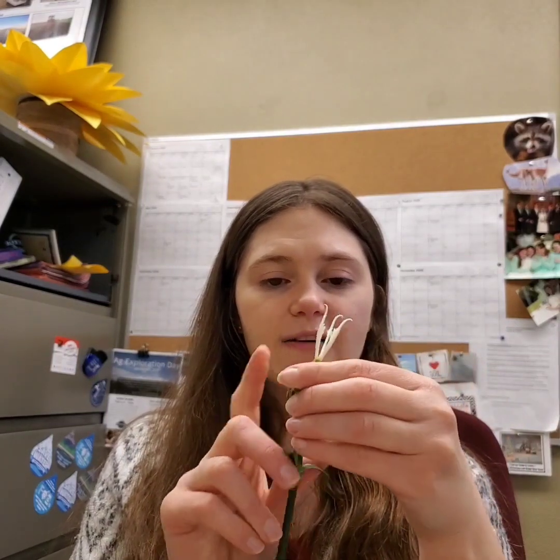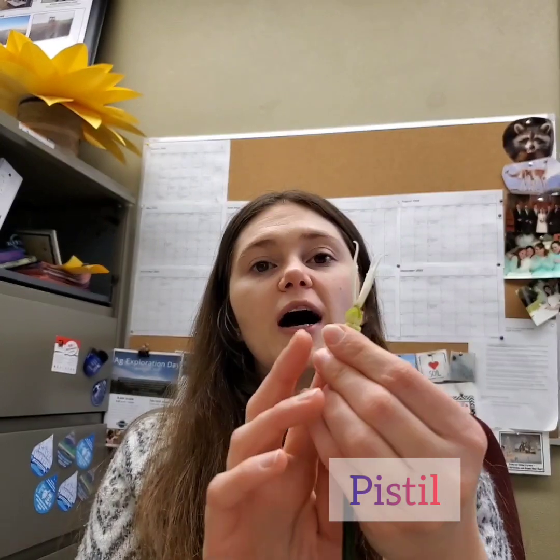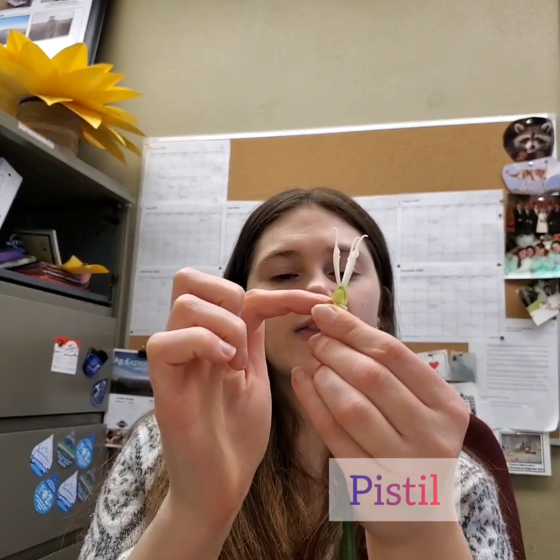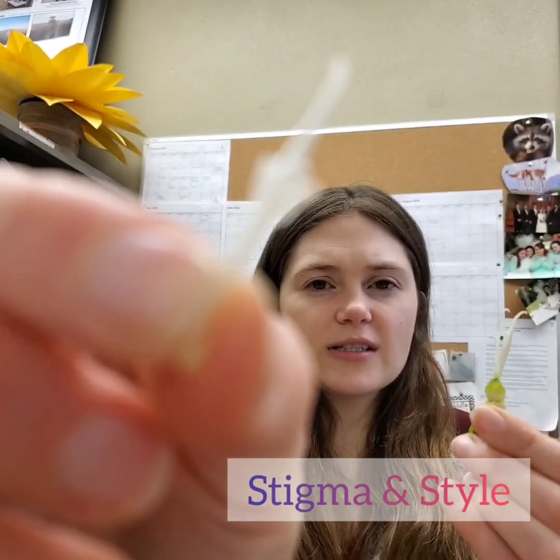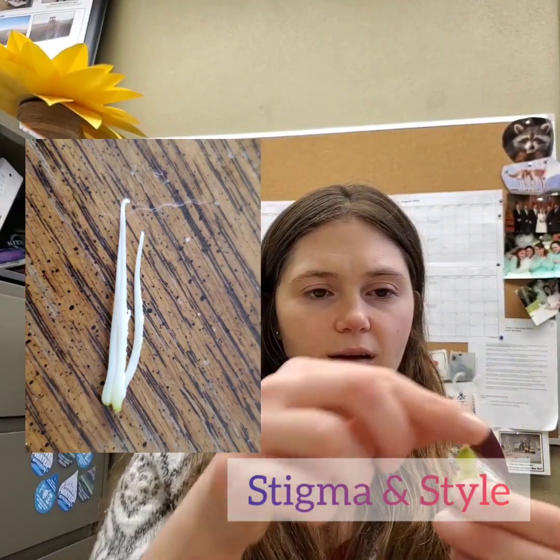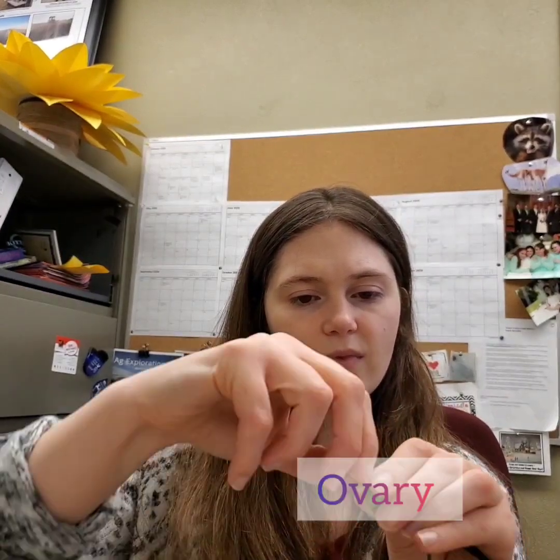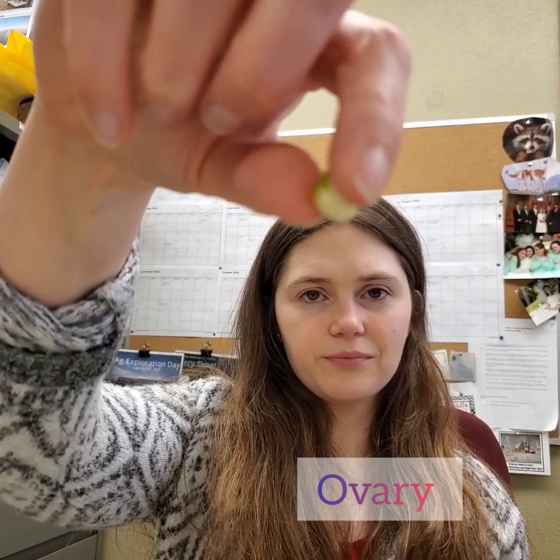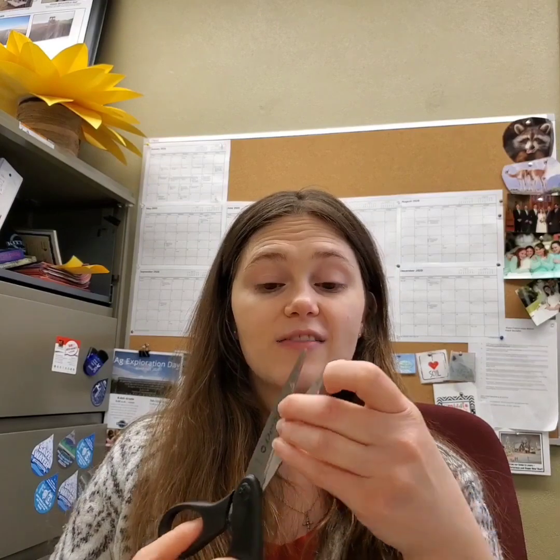Now we are left with the pistil. So the pistil is comprised of the stigma, the style, and the ovary. So here is our stigma and style. And here's our ovary. And this again is where the seed is produced. All right, so for this I'm going to use a pair of scissors, and I'm just going to cut this in half so we see what's inside of this ovary.